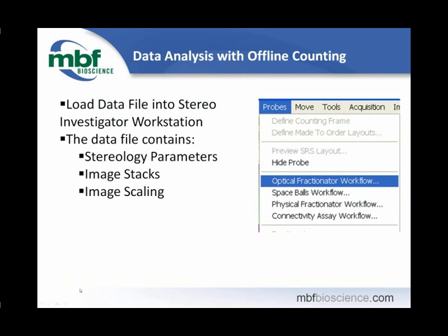Okay, so what do you do once you've let your ZEISS confocal run all night, collecting hundreds of image stacks and naming them for you and putting them in a space where you can get them later? Right. We're going to take you through the process real briefly of now what. The next thing to do is to count those image stacks. And there's a couple of different ways you can do it.